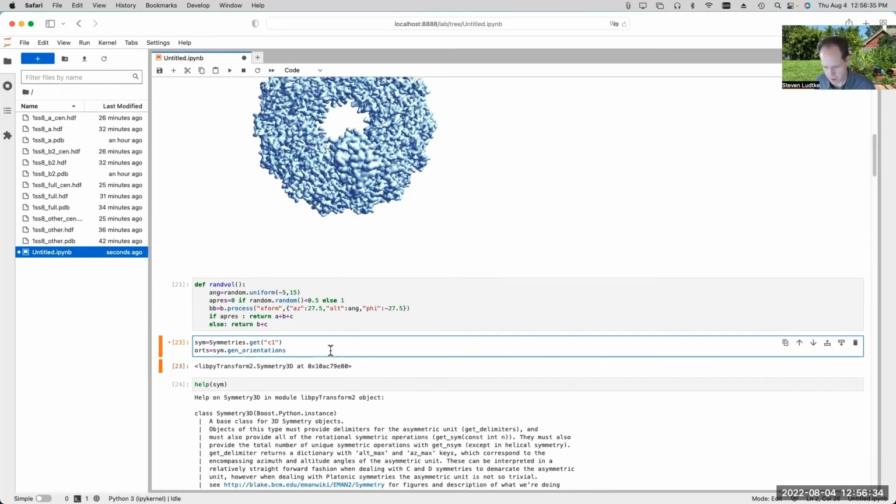So the generator name is going to be rand. That's what we're looking at the command line. And then parameters n, let's make, say, 1,000. And include mirror, yes, and phi2. We'll go ahead and do that as well.